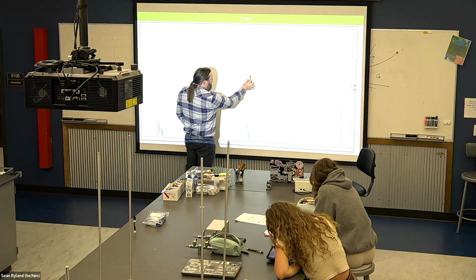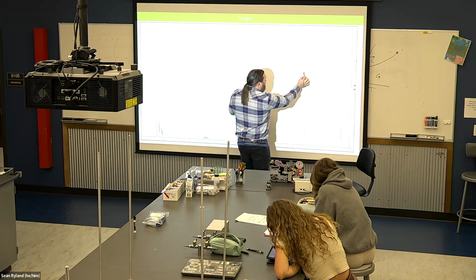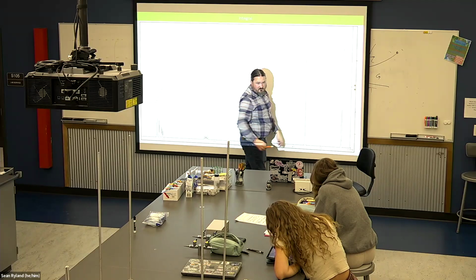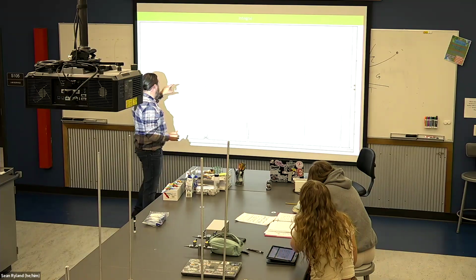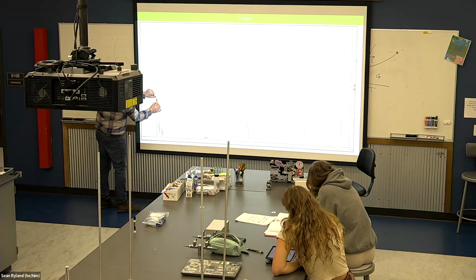That looks very clearly to be really close to 2. 1, 2.5. Right? You basically are just going to go through, find your smallest peak and measure everything relative to that.